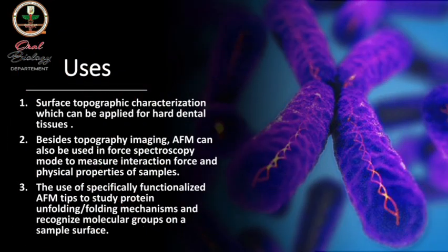Now let's move to the actual uses of AFM. First of all, it's used for surface topographic characterization, which can be applied especially to hard dental tissues.